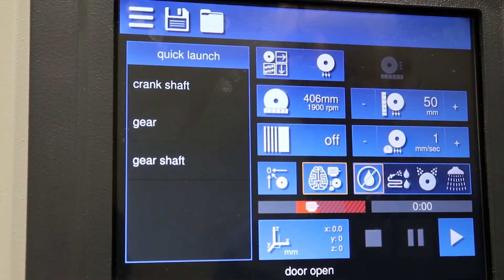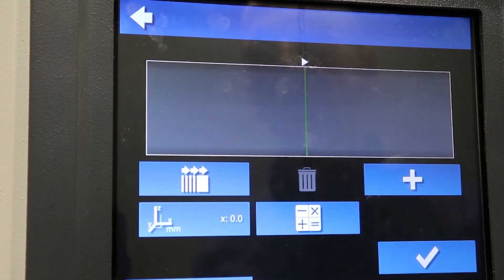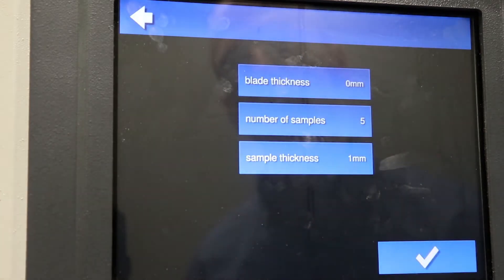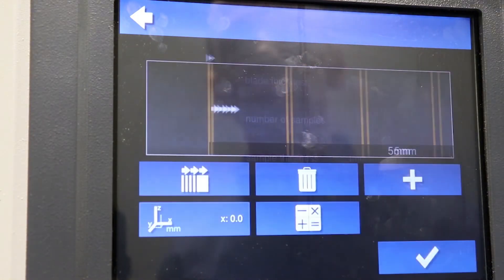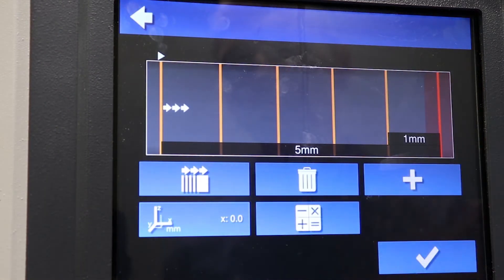This machine also has serial cutting capability. This allows the user to pre-program a series of cuts in either the positive or negative X direction. These cuts can be entered into a program and saved for recall later in the event that type of cut is used repetitively. One can either program a series of equal cuts of the same thickness across a part, or simply move the saw along the axis and use the laser to align and select areas where you wish to cut, then save that program to make those cuts later.